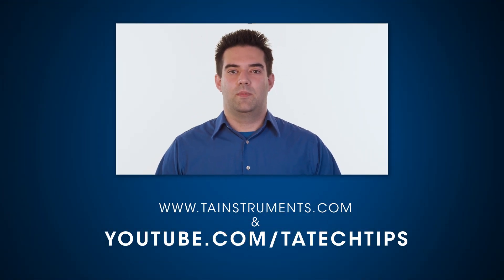In this tech tip we showed you how to set up a temperature ramp on the DMA 850. Stay tuned for more helpful tips from TA Instruments and thank you for your interest.